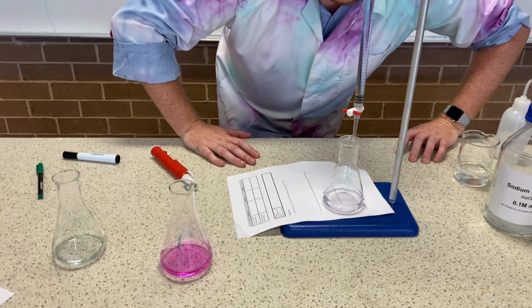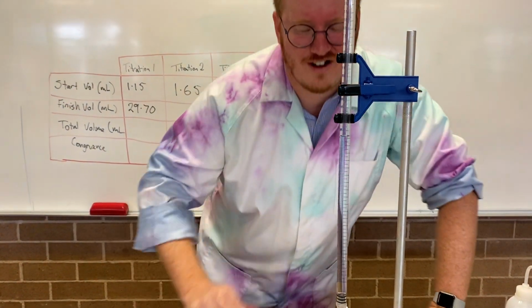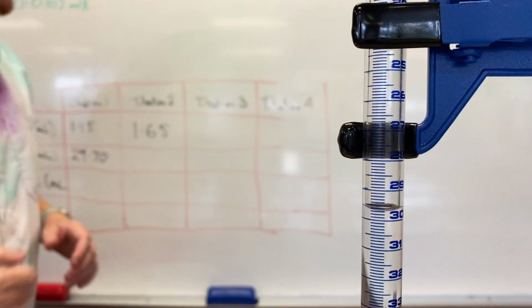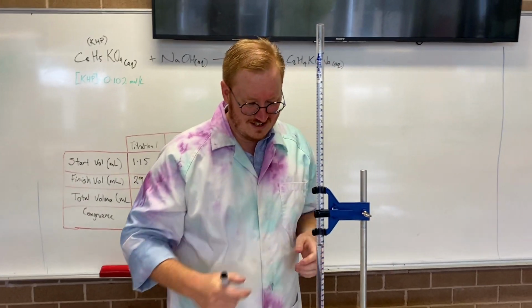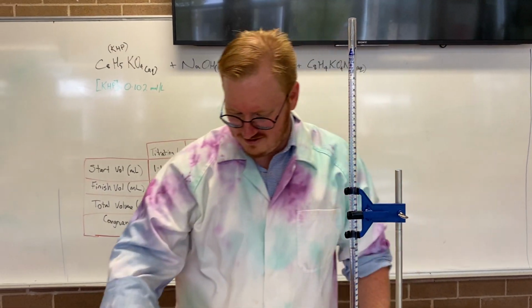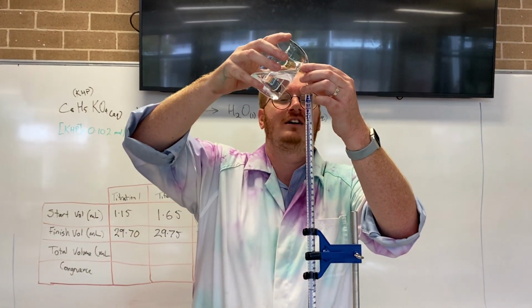All right, I'll read my final volume. 29.75, I reckon. What do you reckon? You concur? Yep. Yep. All right. Really good. Just a touch of pink in there. All right, I'm gonna have to top up the sodium hydroxide to do my third and final one.